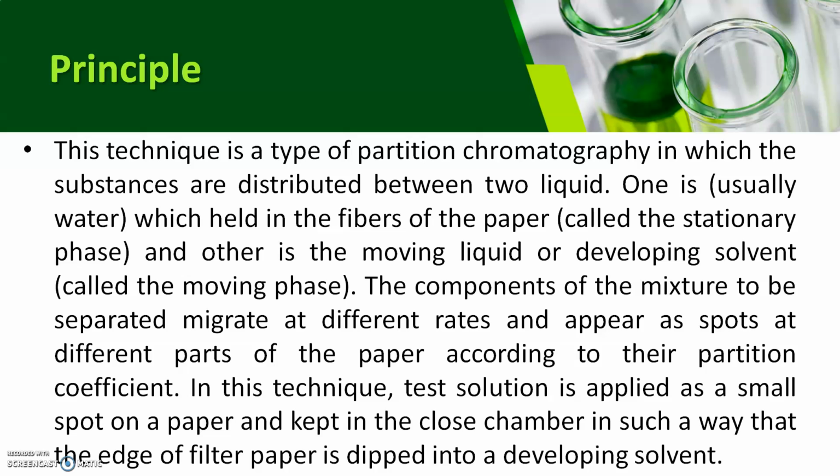The components of the mixture to be separated migrate at different rates and appear as spots at different parts of the paper according to their partition coefficient. In this technique, the test solution is applied as a small spot on a paper and kept in a closed chamber in such a way that the edge of the filter paper is dipped into a developing solvent.